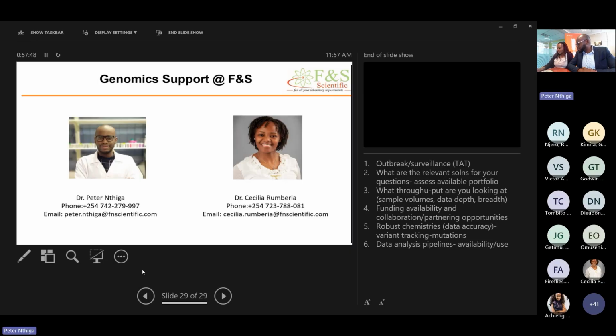Okay. So another question is, does Illumina use proprietary data formats within BaseSpace that might not be universally usable? So no, Illumina uses standardized data formats. So the FASTQ, VCF files, the data that you upload and analyze within the cloud or even your BaseSpace account is the standard universally available data formats. So yeah, it makes it very flexible and accessible.